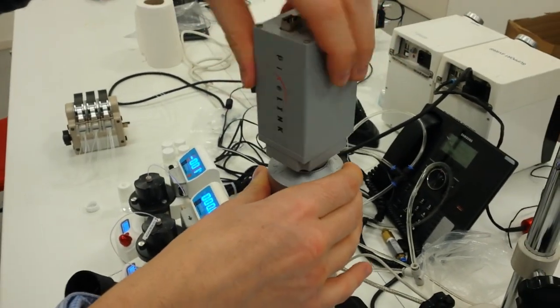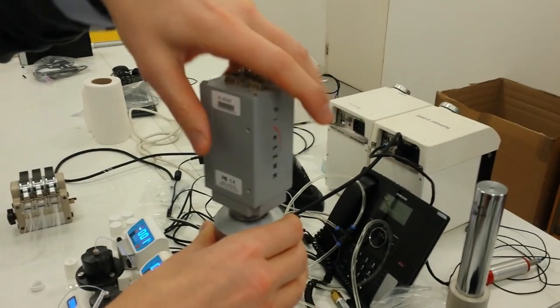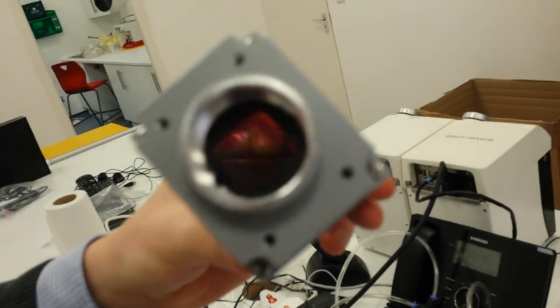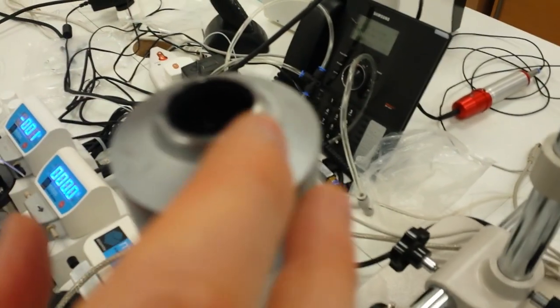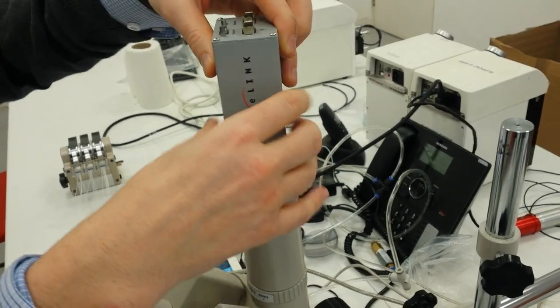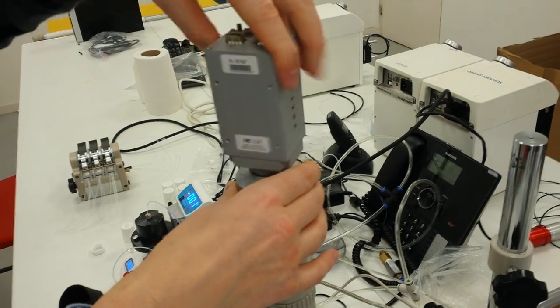This fitting I believe is a C-mount. As long as your microscope has this kind of thread—it's called a C-mount thread—and there's the male on the microscope itself, as long as your microscope has this C-mount, then we can screw it on.